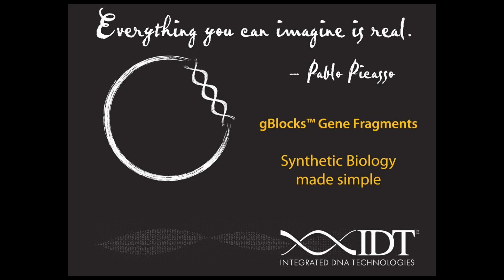But one of the more interesting things that I've found in developing these rules and in looking at past manufacturing failures and successes was that oftentimes, and most often, our gBlocks don't fail for a single reason. They fail because of a combination of multiple reasons. And so we've designed our rules to reflect that. Most of our rules add a certain score to a total score, and it's only when that total score goes over a threshold that we reject a sequence. So it's often the case that it's more than one minor issue that causes a failure.